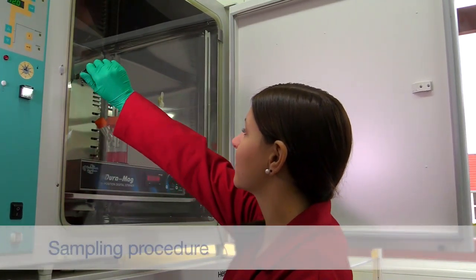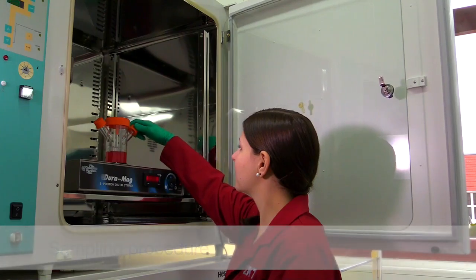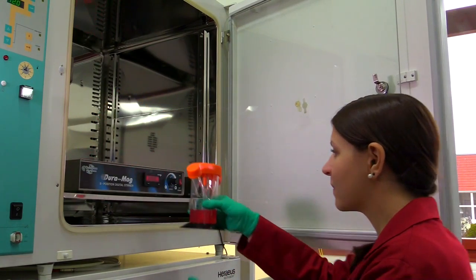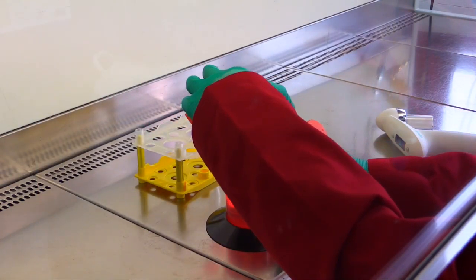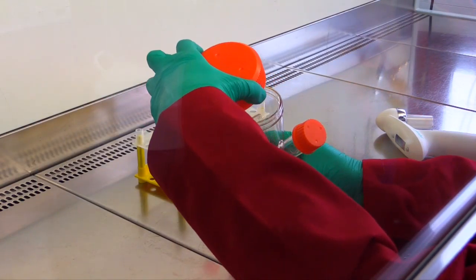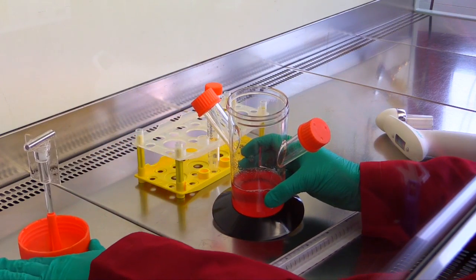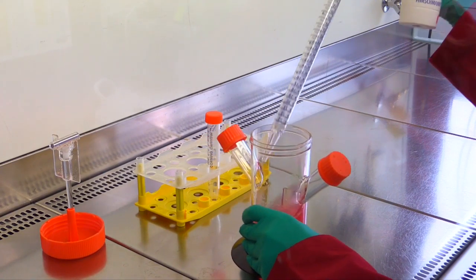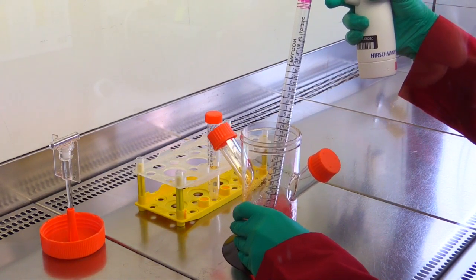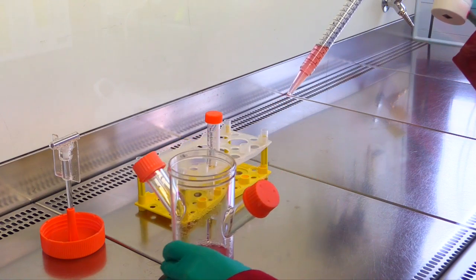For the sampling, the spinner flasks are transferred onto the laminar flow bench, but before removing the spinner flask from the incubator, all lids are closed. Then, every spinner flask is handled in the same way. The central lid with the impeller is opened and placed upside down at the back of the bench. The flask is shaken vigorously with one hand and simultaneously a 5 milliliter sample is taken with a 25 milliliter sterile pipette. The homogenous mixing is crucial to ensure reliable sampling.